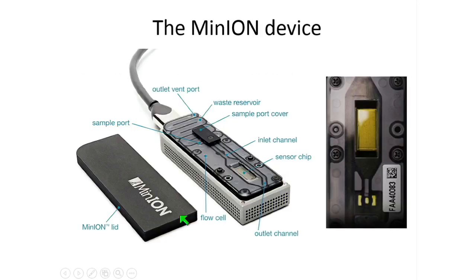So this is the Oxford Nanopore MinION device. I'm going to go into some details about its capacity, and I'm really going to focus on this. Although there are other nanopore platforms in development and have been announced, this is really the only one you can get your hands on now and start using.